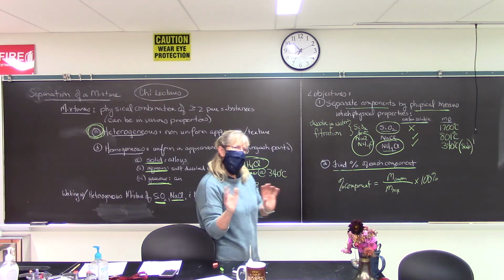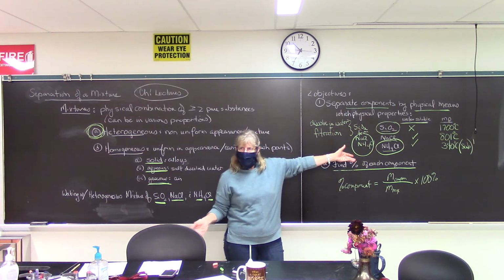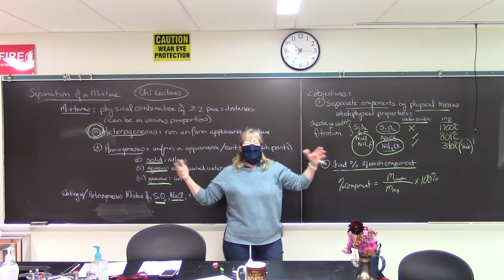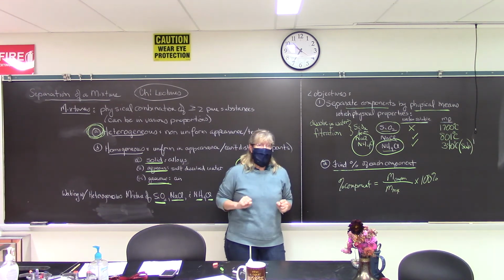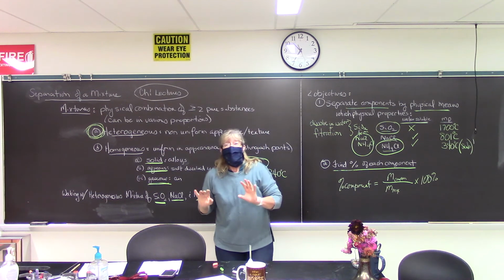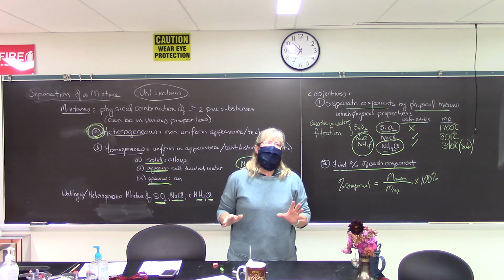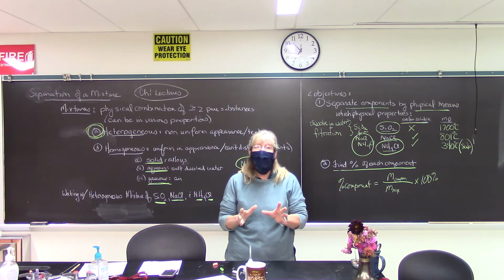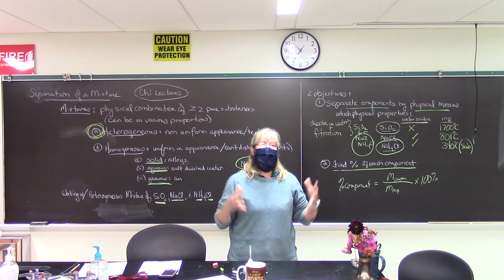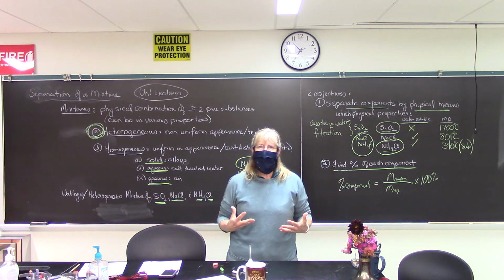So you may be saying to me, Mrs. French, why not start with dissolving in water and then blowing off the ammonium chloride? Well, first of all, we didn't design the experiment that way. We could do it that way, but it's a little more difficult, and you don't get that lovely ammonium chloride sublimation.